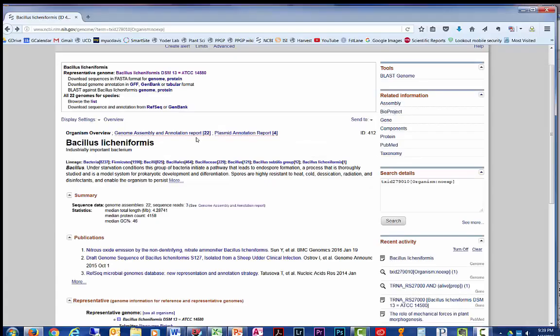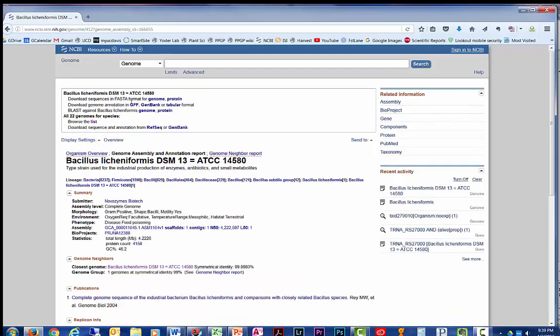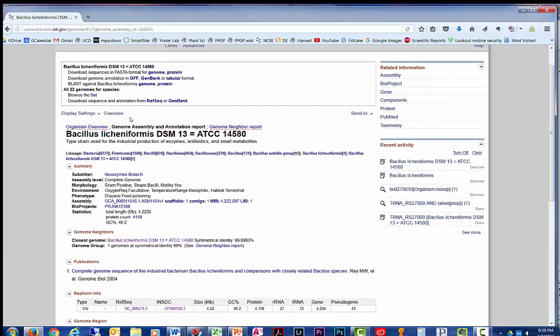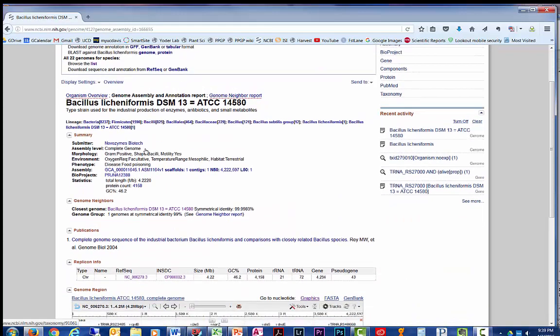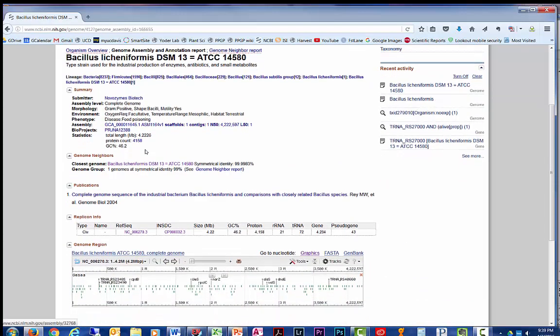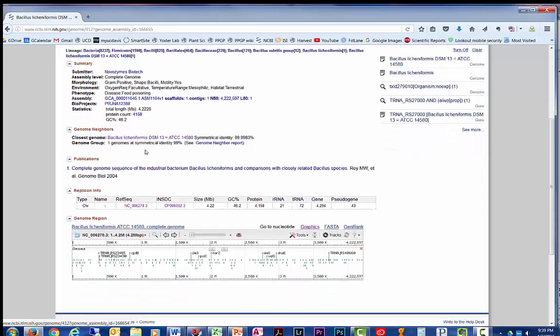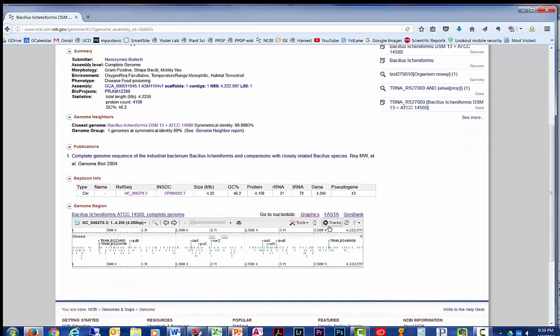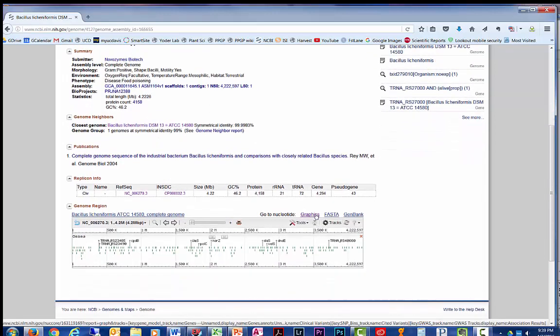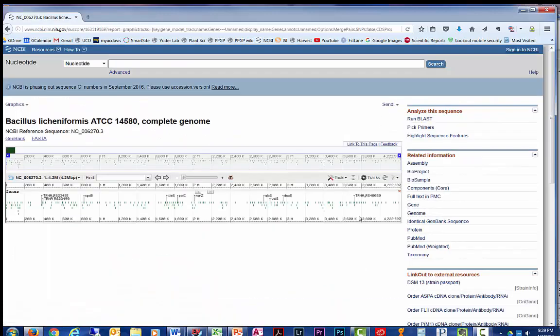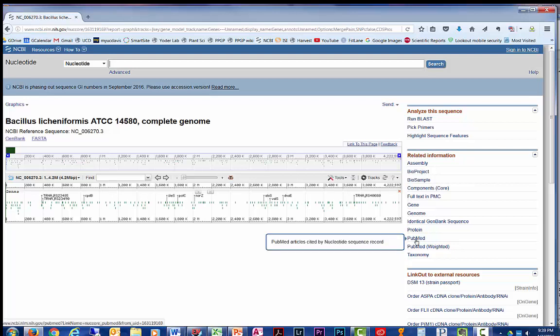Return to the genome view of the organism. Click on the representative genome link. Scroll down to near the bottom of the genome region, and click on the Graphics link to see the genome browser. This image represents all 4.2 million bases of the genome.